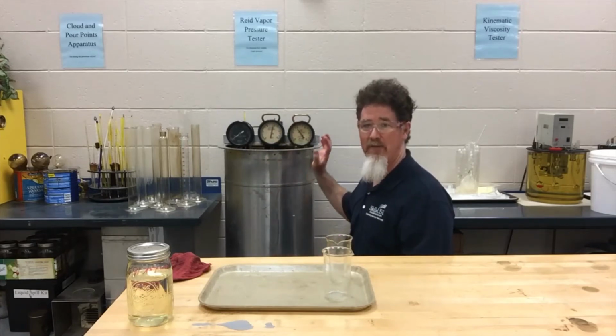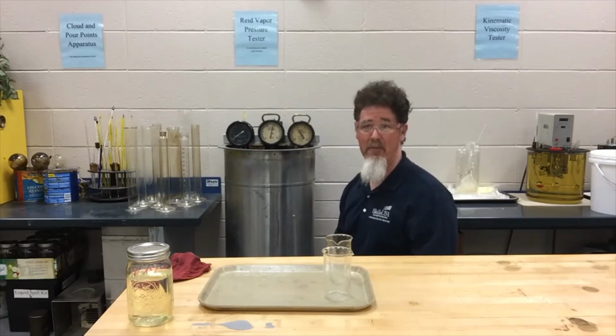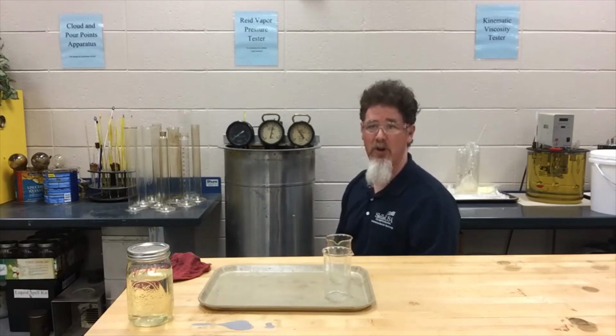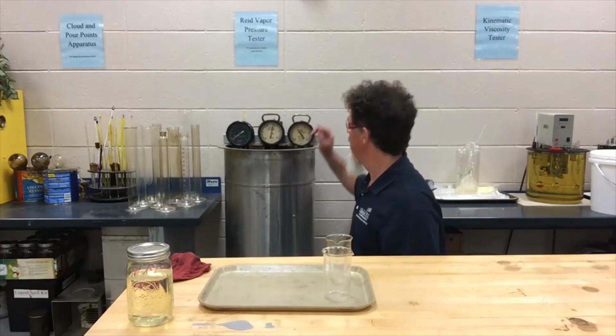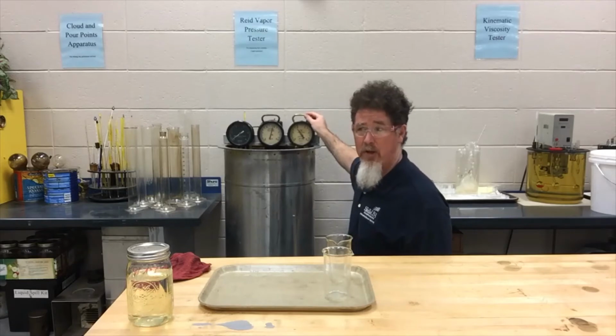And so now if I took this fuel sample and tried to start a lawnmower on a cold day, or your chainsaw, or it could be your pickup truck or your car, it could be a problem. So we're pretty steady at about 8.5 on that 89 octane, so I think I'm going to call it that.